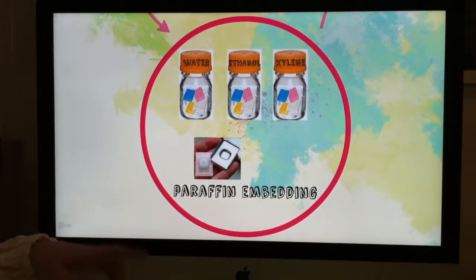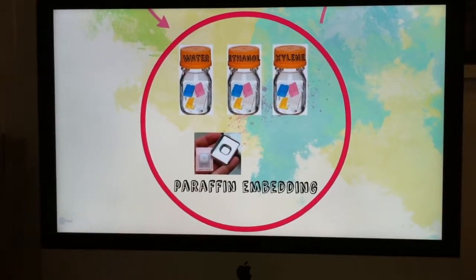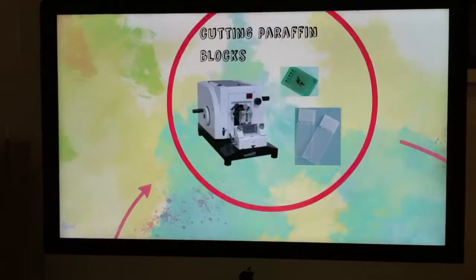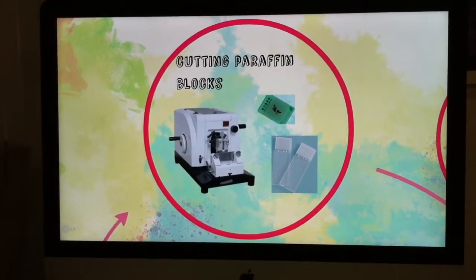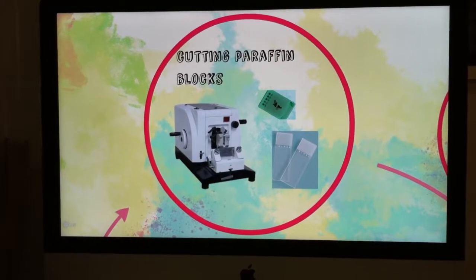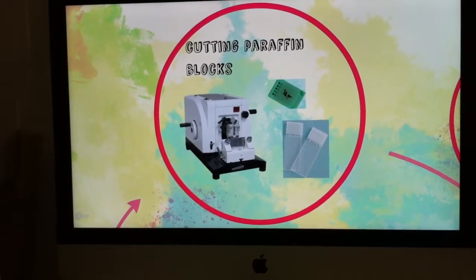Next day, we will include the tissue in a cassette using these metal boxes. Then the tissue is ready to be cut — in our case the slices are between 4 and 5 micrometers — and we will place it on a glass slide.